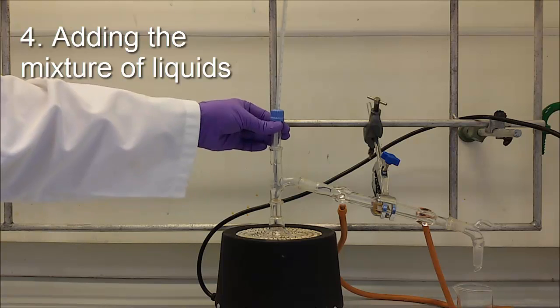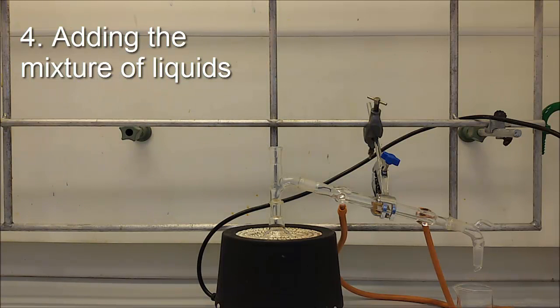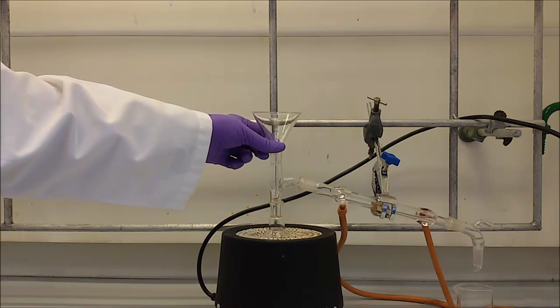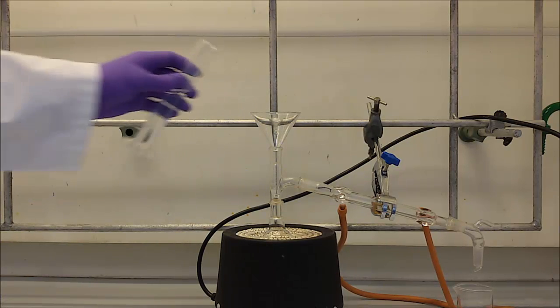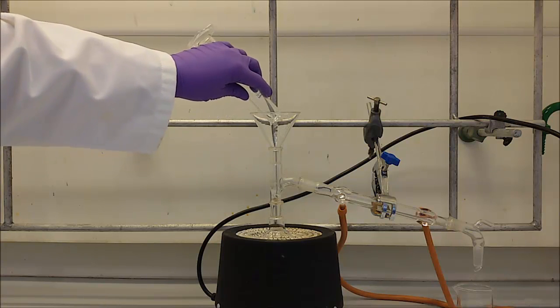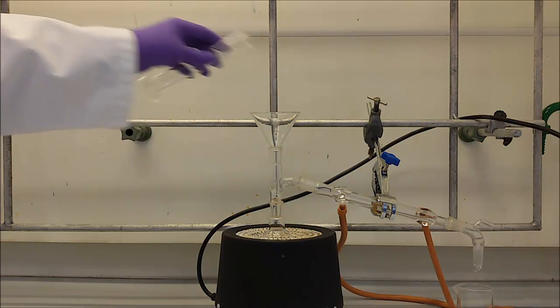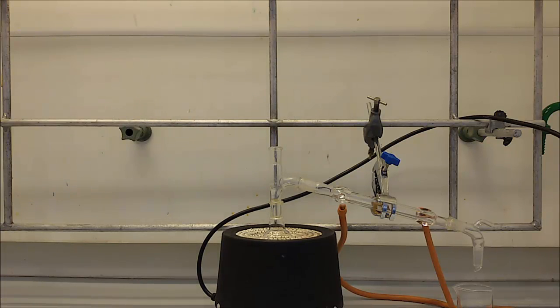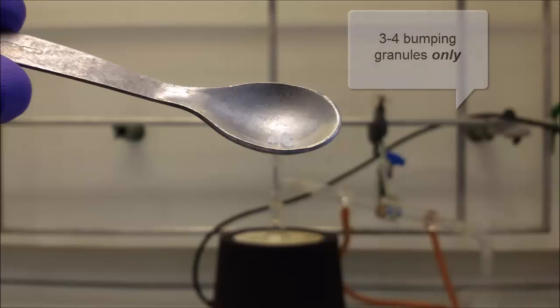Take off the still head and transfer the liquid to be distilled into the flask with the aid of a funnel. Put three to four anti-bumping granules into the flask.